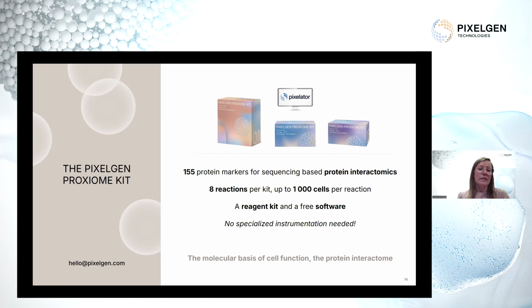In a general experiment, we get around 50,000 molecules per cell. When we have done calculations on T cells and their surface area, that gives us a resolution of about 50 nanometers between the individual proteins. If you have cells that express very high densities of proteins, for example, different cell lines like Raji cells, you can get even up to 150,000 molecules per cell. These cells are, of course, bigger as well. But you really get high-resolution spatial information from one of these assays.